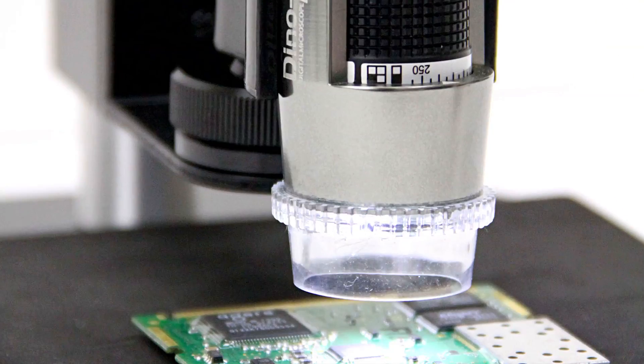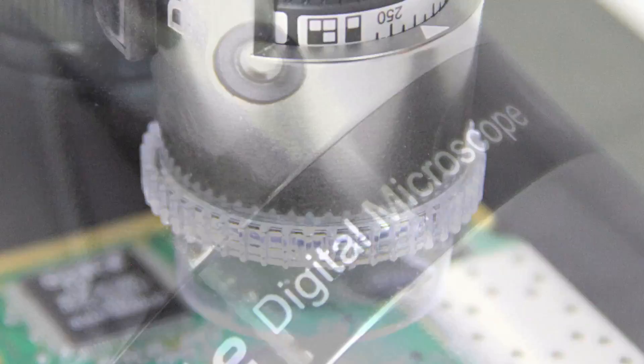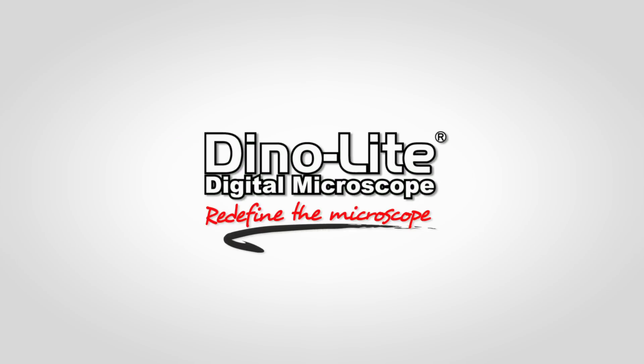The AM5018 Dino-Lite Digital Microscopes are easy to use, don't require a computer or additional software, while providing high quality imaging with no delay, all in a compact portable design. For more information, visit us at www.dinolite.us.